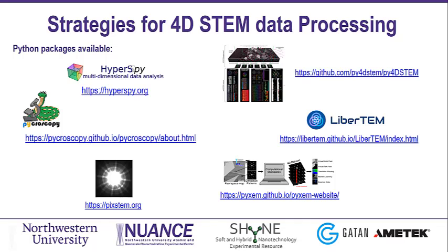You can also use those packages in conjunction with Digital Micrograph, as Anna showed earlier, using the Python interface from DM to run those packages.